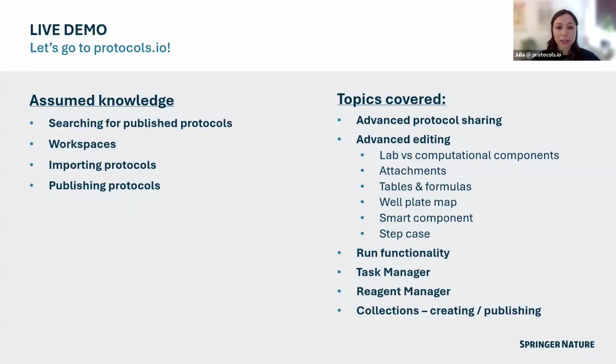So what I'll do now is I will jump out of the slides and into protocols.io. Because we are covering some more advanced topics today, I will be assuming a certain level of knowledge with protocols.io. That is searching for the public content, the basics of workspaces, maybe importing and publishing protocols. If you aren't familiar with that, it is fairly straightforward and you can go back and look at that intro link that I put into the chat earlier.